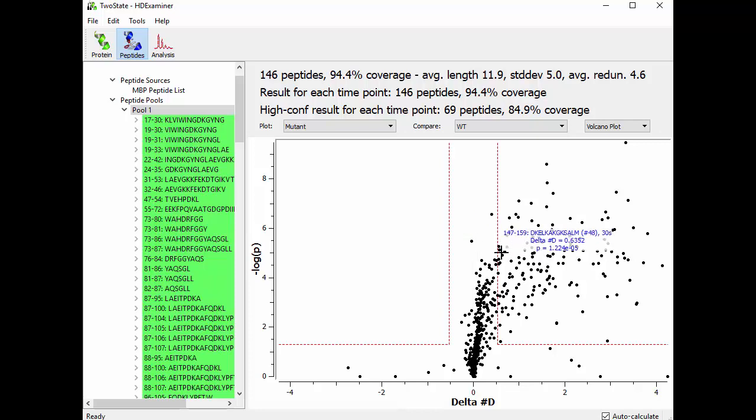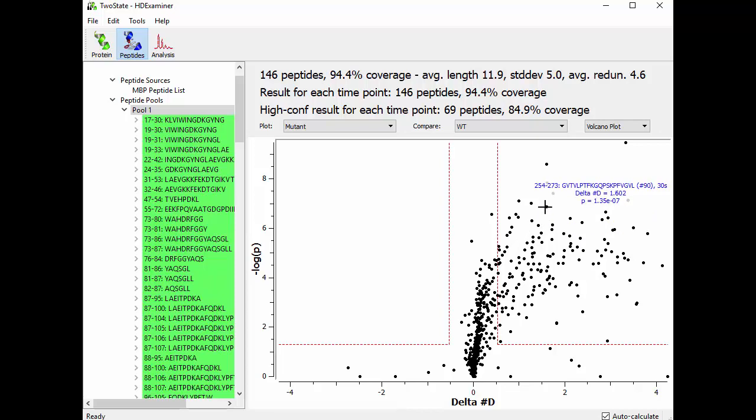So what we're doing here in the volcano plot is we're essentially taking every measurement that we've done on a peptide at a time point and we're subjecting it to two different significance tests. The first being the P value test. Is the P value low enough? And the second being, is the difference bigger than the replicate variance that we've measured across all of our data?